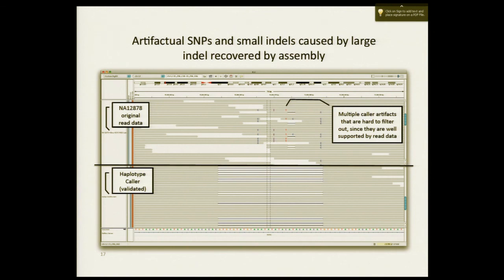Have you tried the unified genotyper? Say that again. So if you use the unified genotyper to do what? To align these reads to get a signal with the haplotype. Well, potentially if this deletion was in, for example, dbSNP or whatever your database was, you could use the indel realigner, and potentially it would realign those reads to that variant. Probably in this case it wouldn't, though, because the event's too large, and I think there's some limit of like 10 base pairs in the indel realigner. So it doesn't allow deletions of size greater than 10, or something like that.